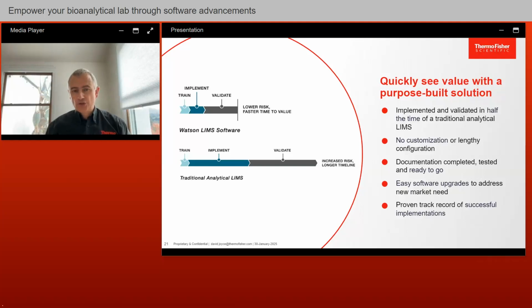So you have the installation qualification document where you show it's been installed correctly. And then there's a very comprehensive operational qualification. That operational qualification is a process where you go through each one of the functions of the system and ensure that it complies to what it did when it left the factory, if you like. So you're confirming that the system does what it's supposed to do, and does it in a consistent manner.